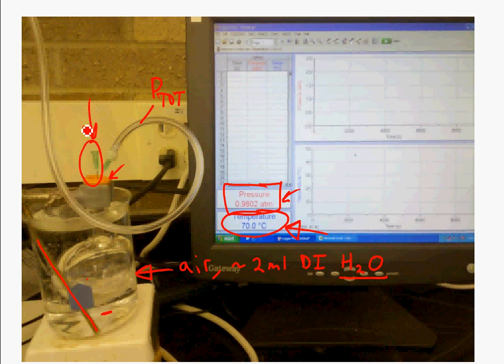That's why we have this needle valve, or this needle, stuck in there to let it equilibrate. So we set up our system, we heat up our water. Those are nice flames. Those are pretending to be flames. We heat up our water till everything gets nice and stable. We might shut off the heater at about 65 degrees, and the temperature will still get up. So somewhere around 70 degrees is where we want to start our experiment.